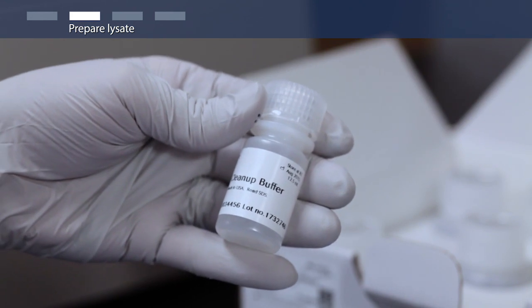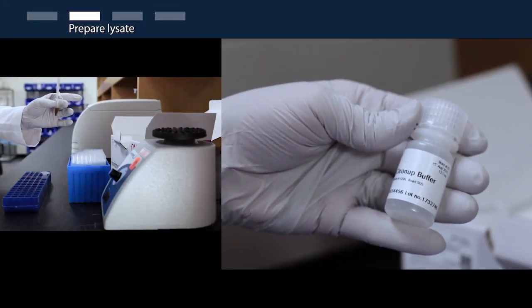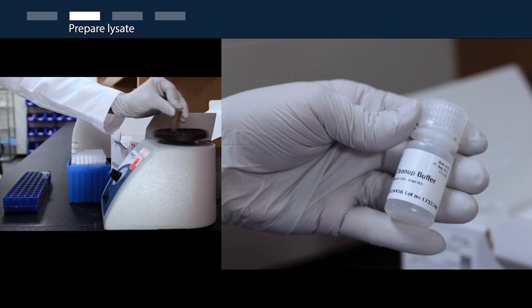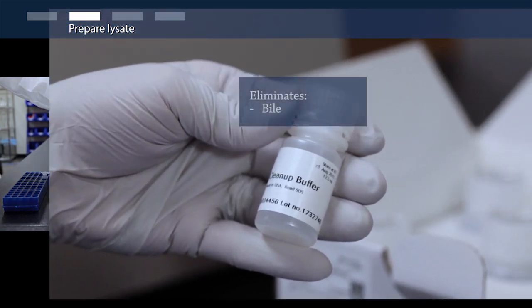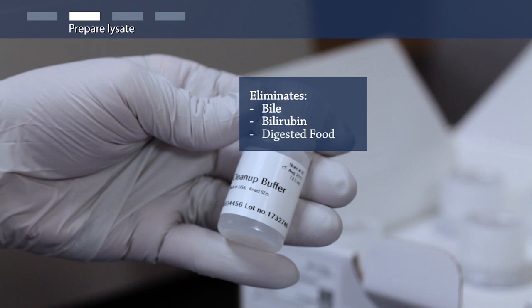Now, add 250 microliters of cleanup buffer and vortex immediately to ensure even dispersion. This step eliminates inhibitors of downstream analysis like bile, bilirubin, digested food, and humic acids.